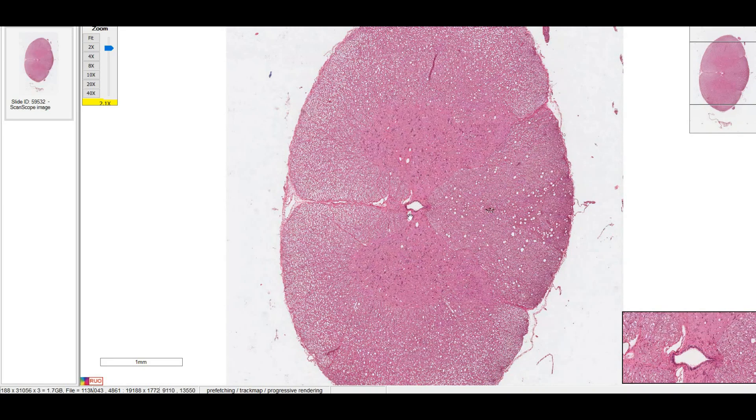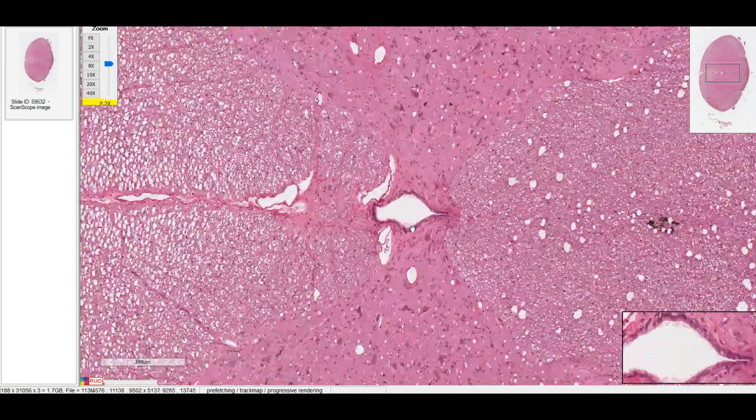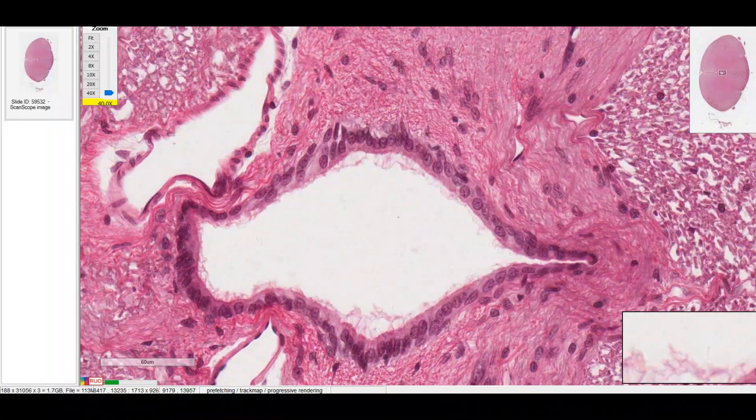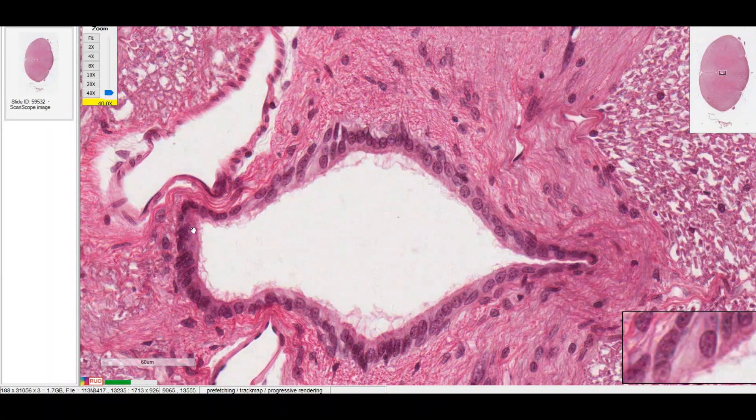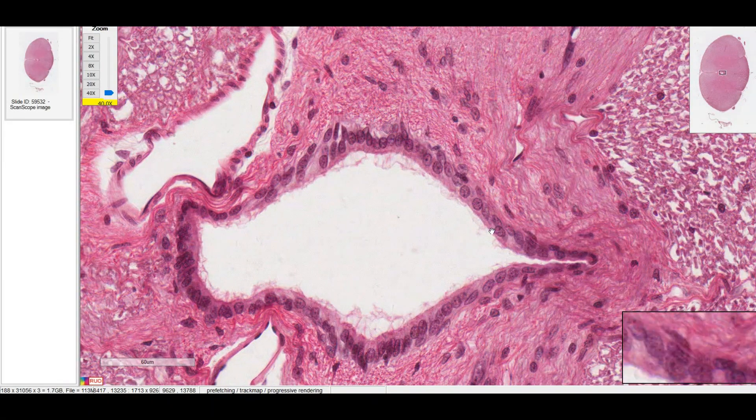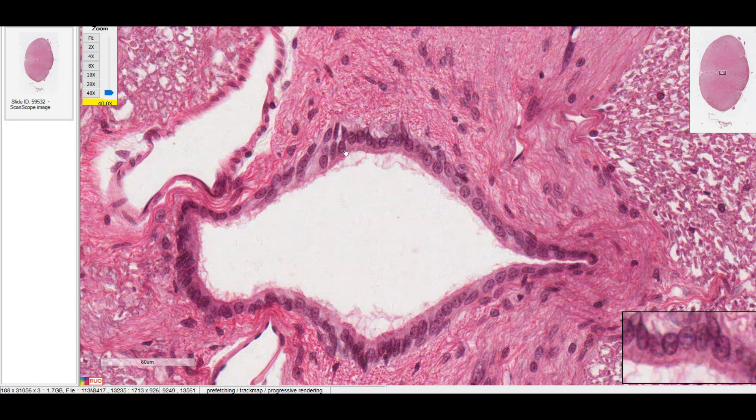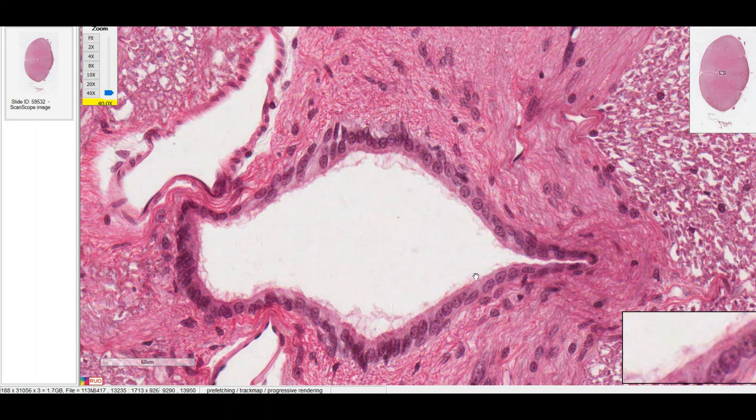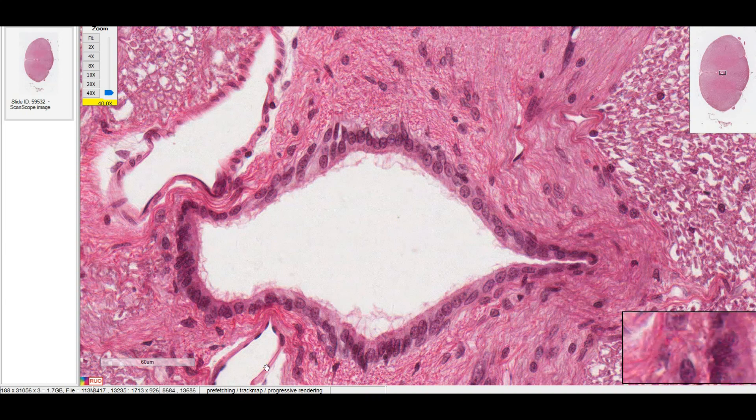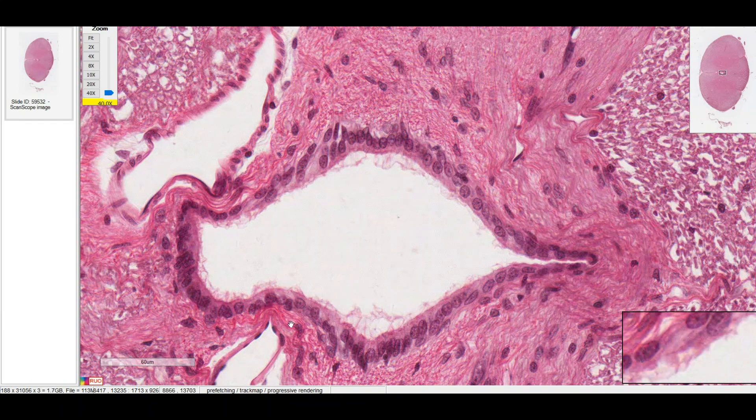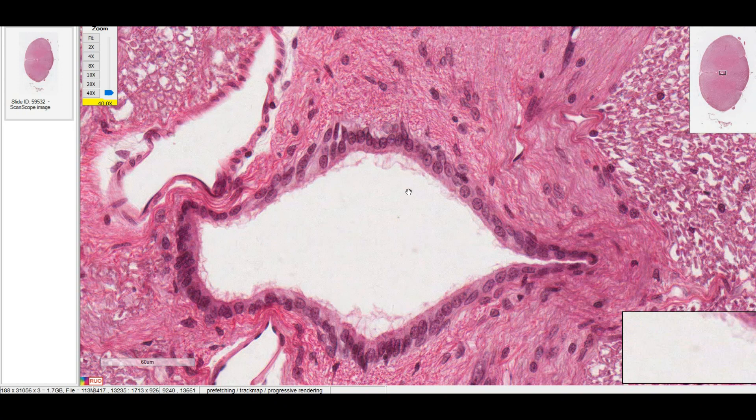On this next slide, we're mostly interested in the central canal here. It's lined by ependymal cells. These are the ones that are secreting CSF. And you can see this simple cuboidal ependymal cells are ciliated. So not only are they creating the CSF, they're kind of brushing it along to keep it moving. And just a quick note about the central canal. This is the thing that expands when you have syringomyelia. But normally this would close off with age.